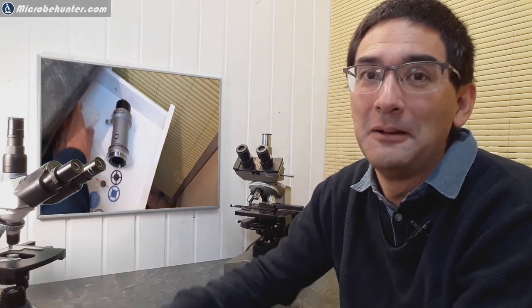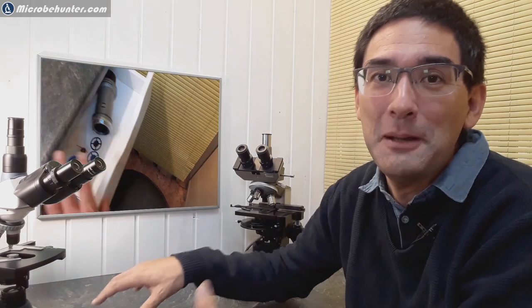So if you have a small corner somewhere that you can simply dedicate to microscopy, I think that's already 80% of what maybe you ever need. Maybe even half of the table, with the other half that's where you do your work, and the other half of the table you simply dedicate to microscopy. And maybe a couple of drawers somewhere where you can keep your tools and your permanent slides. If you've got that, I would say then you're going to be fine in most of the cases.